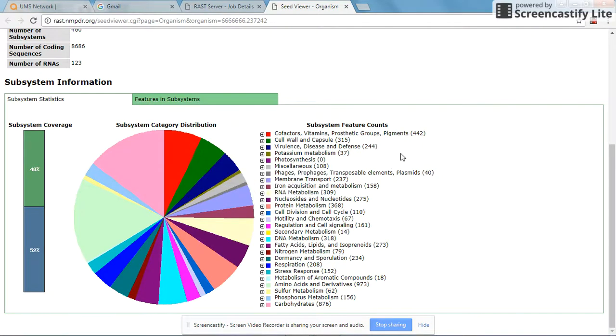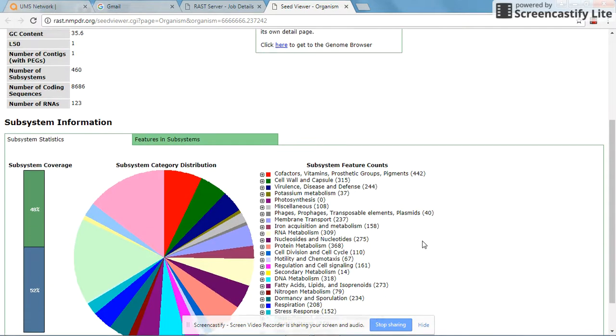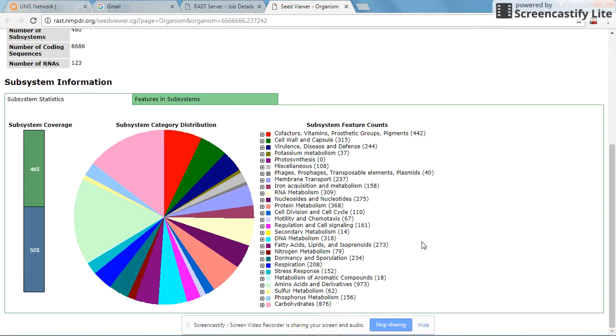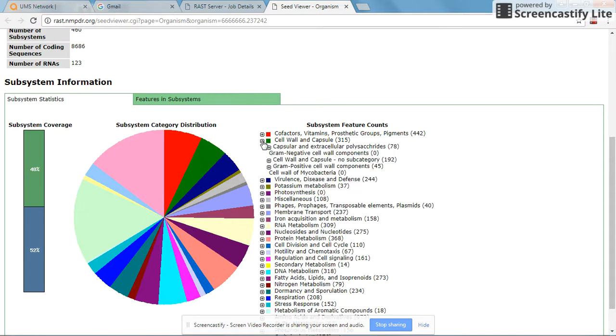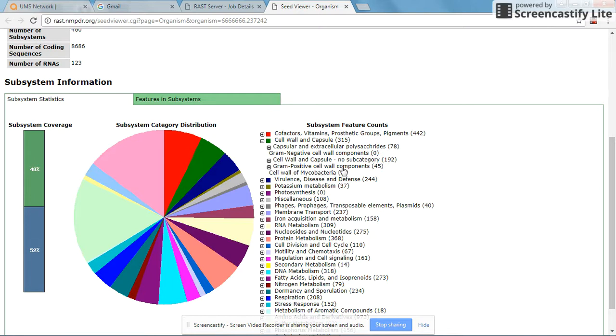This is a graphical representation of the genes which are distributed by category. They are distributed according to their metabolic pathways as well as their functional relationship with the bacterial cell. The first thing I look for is the cell wall and capsule.